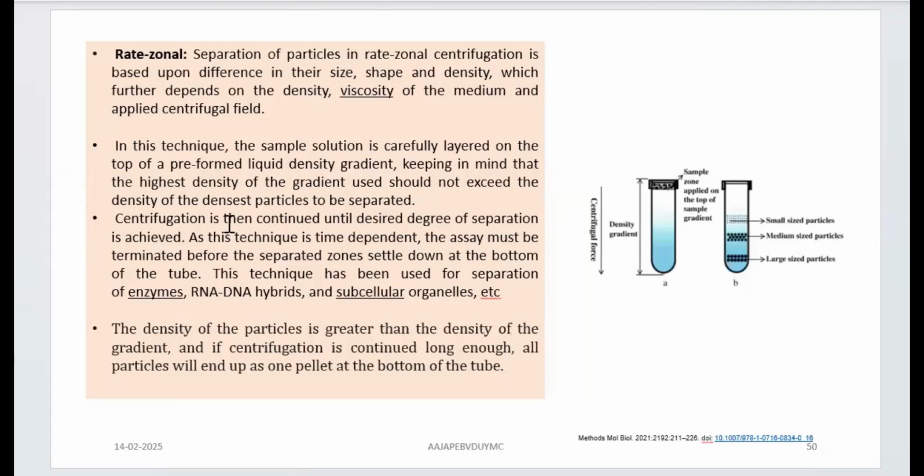Now let's talk about rate zonal in detail first and then isopycnic. Rate zonal separation of particles is based upon the characteristics of the material under separation, and it includes size, shape and density. And of course these factors, as we know, depend on density and viscosity of the medium and the applied centrifugal field. Now what is happening? The sample solution is carefully layered. So you have prepared the gradient first and the sample is loaded on top of it, and then you go for centrifugation at ultra high speed.